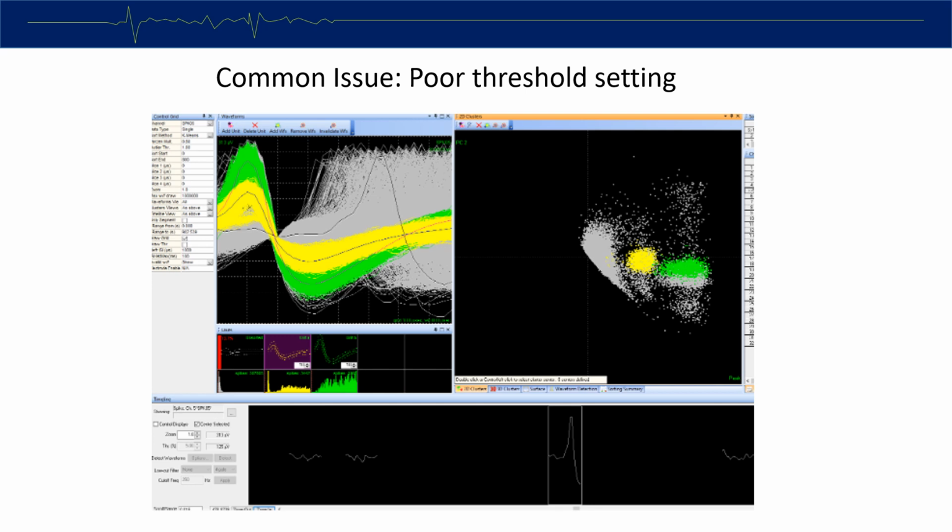It is likely that the waveform in question should be included with the green unit. However, the pre-trigger means its PCA values position it outside of the green cluster. When sorting via an algorithm, it will likely not be correctly sorted into the green unit, and further analysis of this waveform's activity will be inaccurate.